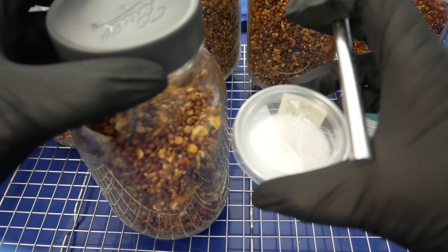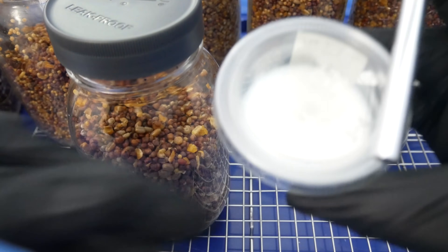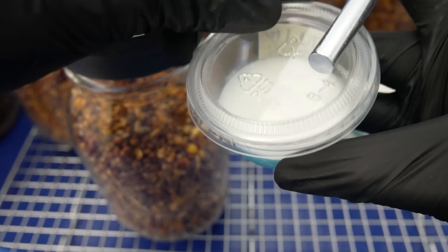As per usual, we'll go ahead and flame sterilize our blade before we work with it. Now we'll go ahead and loosen up our lids on our grain jars and get them ready. This process is going to be very quick — you want to minimize exposure to open air whenever you're inoculating.